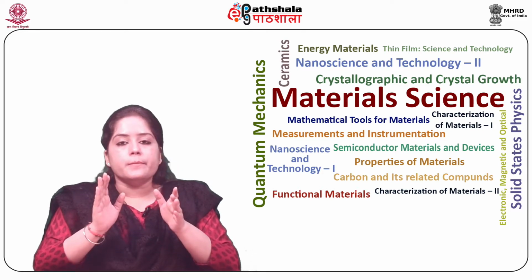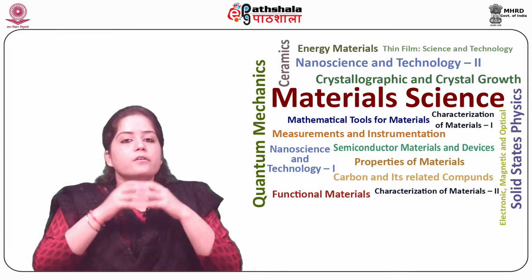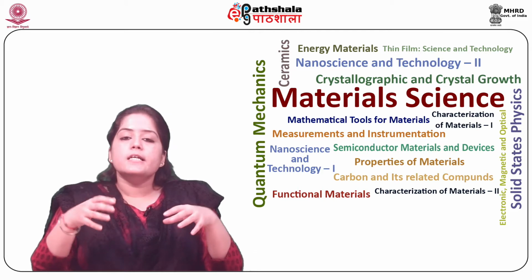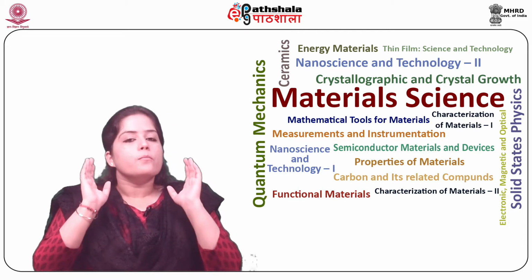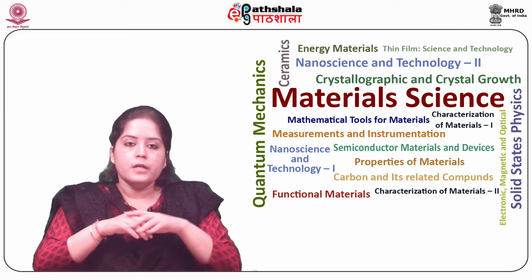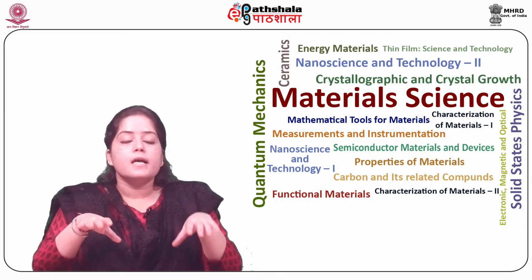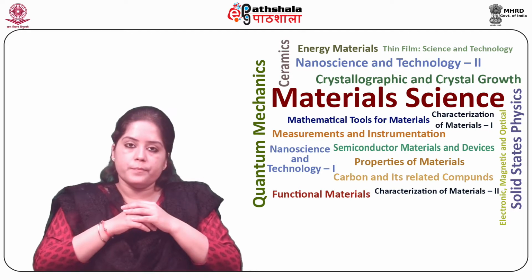Most importantly, the improved spectral acquisition and reproducibility associated with this technique leads to better quality database building for more precise material verification and identification. So ATR is clearly an extremely robust and reliable technique for quantitative studies involving liquids.